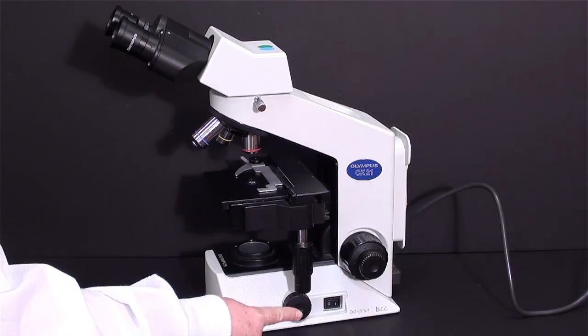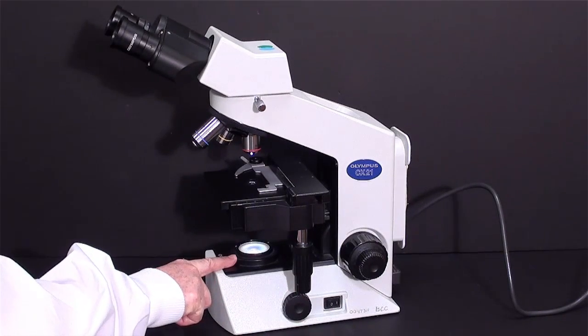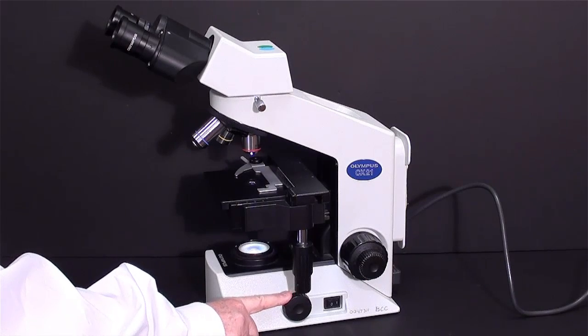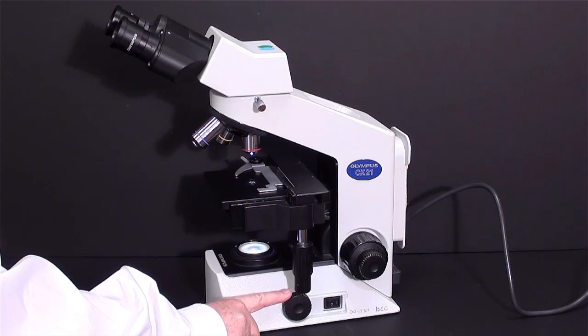This is the light control. This is the on and off switch. I'll turn on the light. You can see the light sources here. If I want to dim the light or increase the amount of light we're seeing.